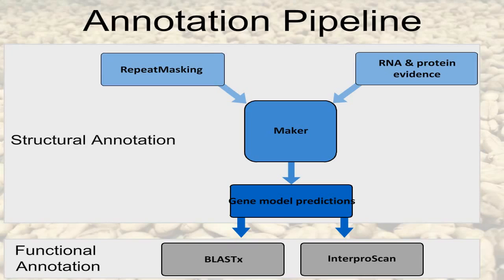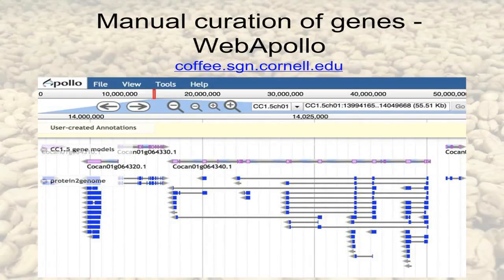So now that we have these genomes, of course the more interesting thing is knowing about the genes and finding them in the genome so further work can be done there. So we have Iso-Seq data from PacBio, which has been really great for annotation since it gives you basically the whole transcript length. And we've used that as well as ESTs and RNA-seq to run the MAKER pipeline. So we trained the ab initio predictors, Augustus and SNAP, and then we've used all of this expression data to predict the gene models in the genome. And then we're making a functional prediction based on BLAST to different databases and also InterProScan to associate the GO terms to these.